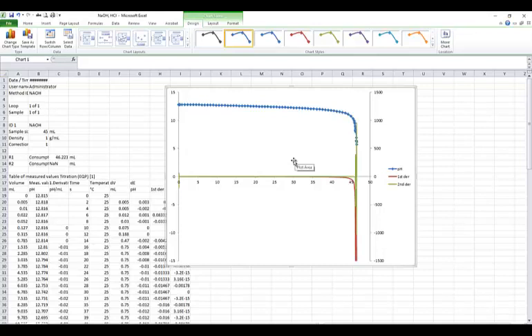So having pH as a measurement on the primary y-axis indicates we're measuring pH, so that gives our measurement. For the type of curve, it's a titration curve, so that should be in the title. Titration curve, and then of what? In this case, it's of sodium hydroxide with hydrochloric acid. So you want to include their volumes or concentrations that you knew when you started the titration. The concentration of the titrant may appear in the title or may appear in the x-axis label, one or both, but as long as it's somewhere on the graph.